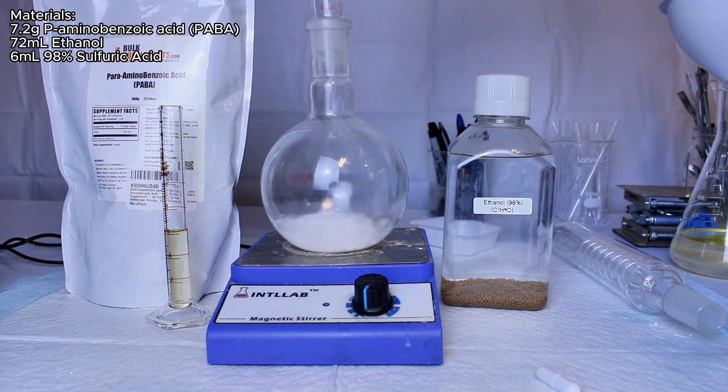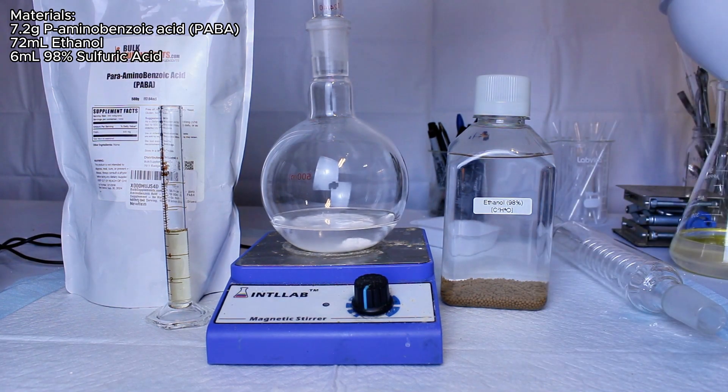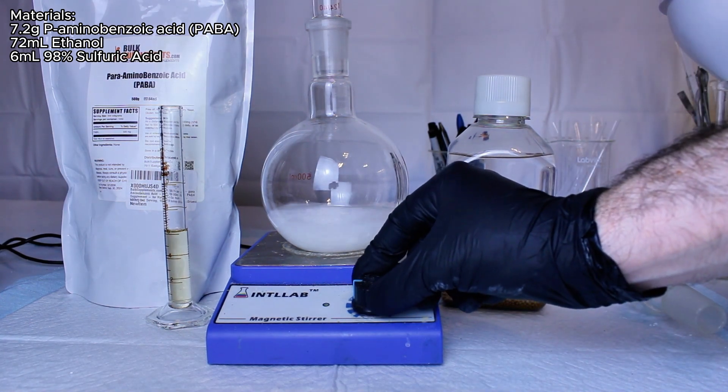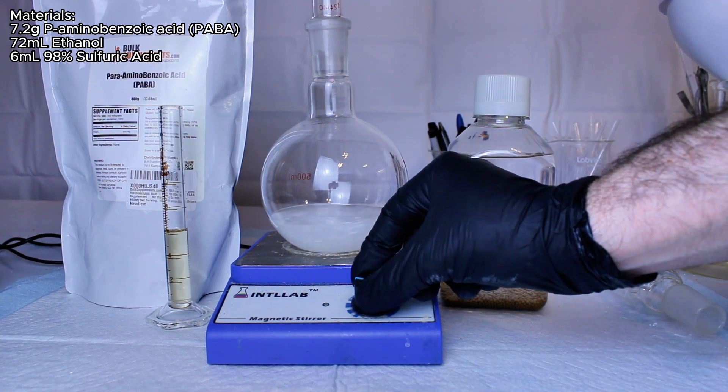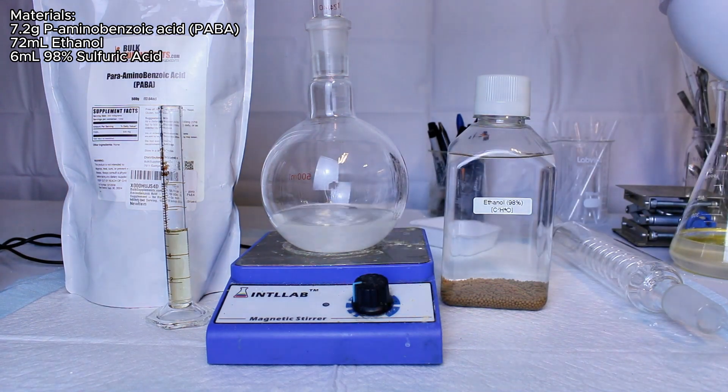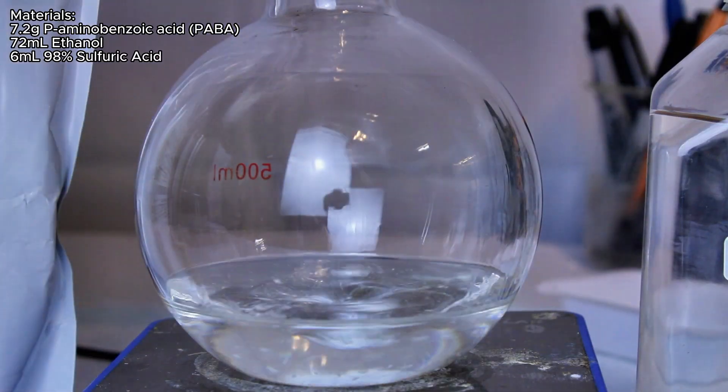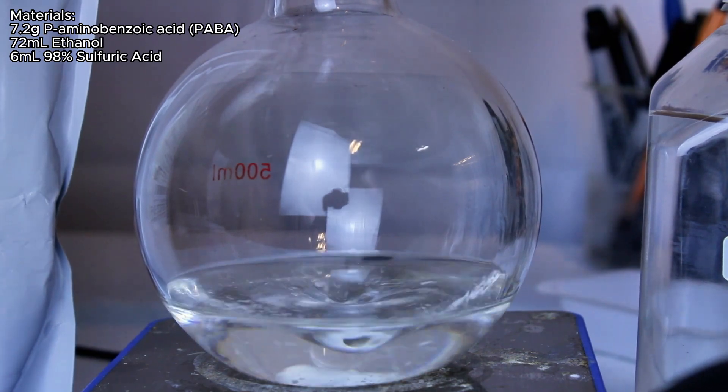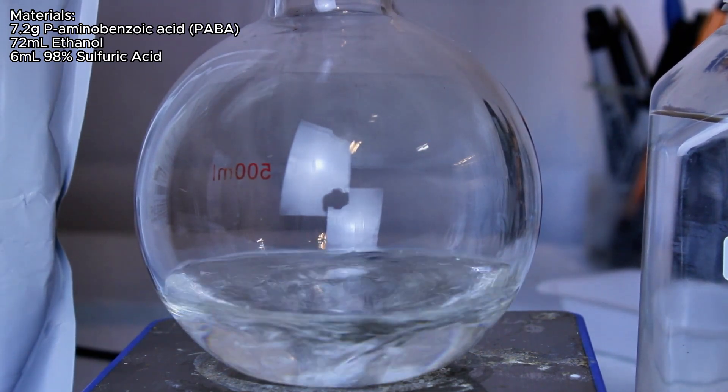The first ingredient is called para-aminobenzoic acid, or PABA, which is weirdly enough sold as a nutritional supplement. The second ingredient is anhydrous ethanol, which I've made before on this channel, and the third is concentrated sulfuric acid, which I've also made on this channel.